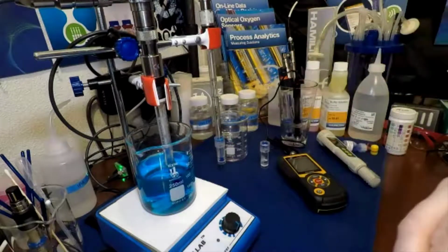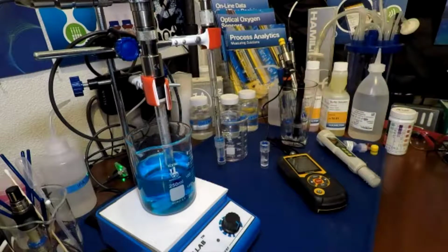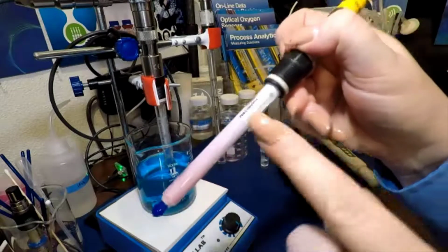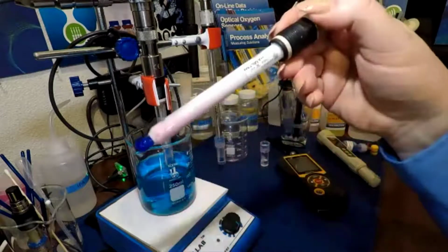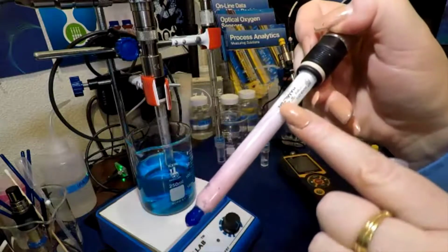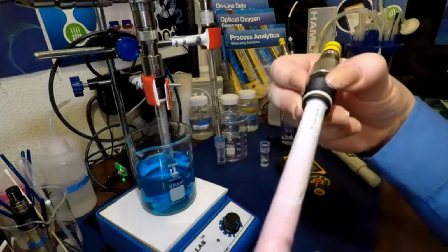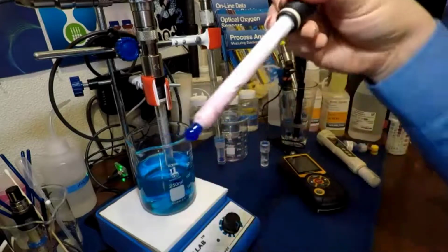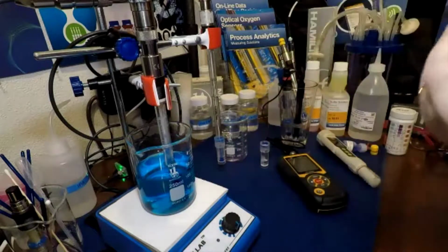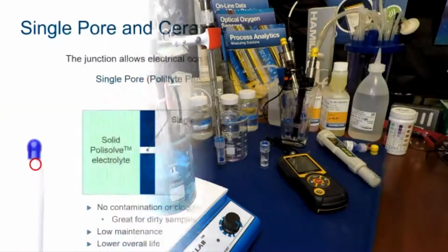If we look at our polymeric probe, this happens to be a broken one, just for your own information. The glass broke and I managed to steal the probe so I could show you what a polymeric probe looks like. But this inside is completely solid, or it's polymer. It's not going to flow out. And if you find the junction on it, it's actually a glass hole right there. It's just been drilled through. So those are two different kinds of commonly used junctions.